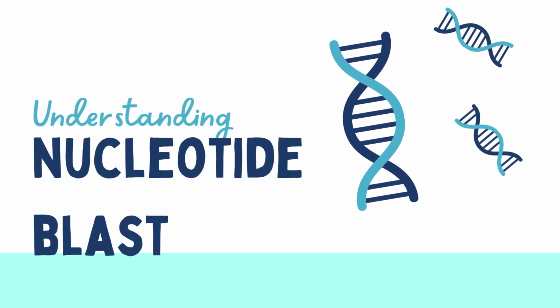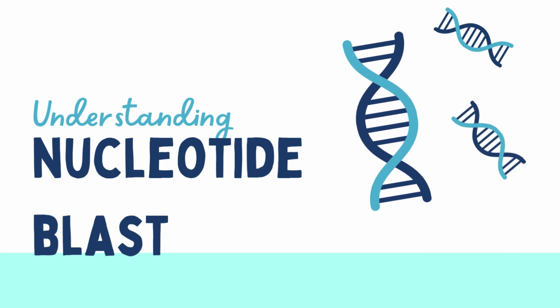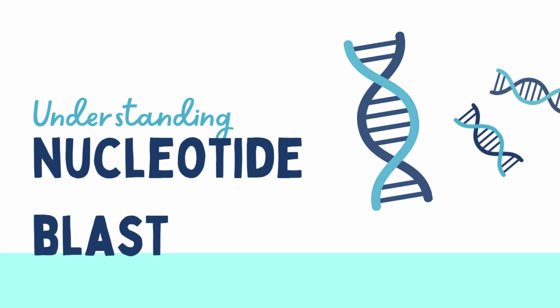In today's video, we are going to understand one of the most important bioinformatics tools used in molecular biology, that is Nucleotide BLAST, also known as BLASTn. This tool is widely used to compare DNA or RNA sequences and identify their biological significance. So let us begin.